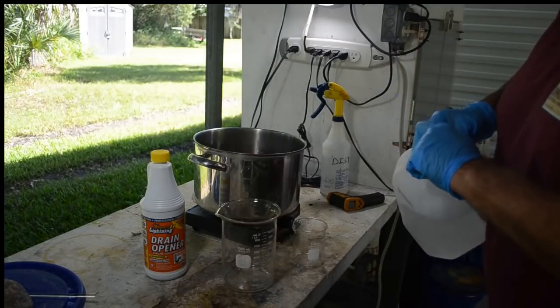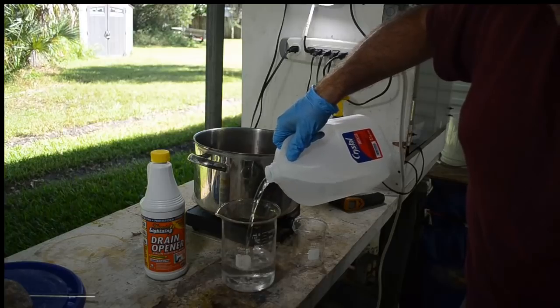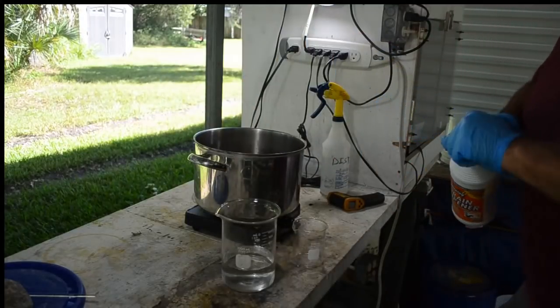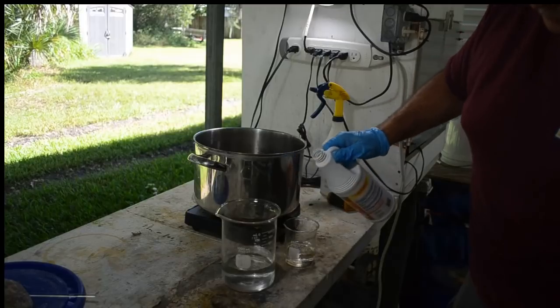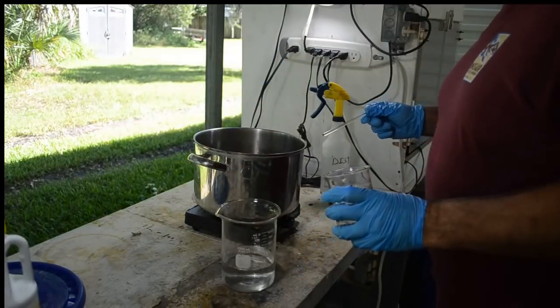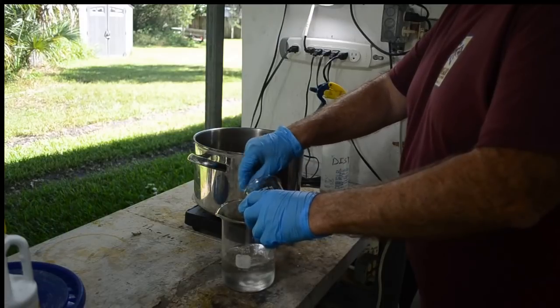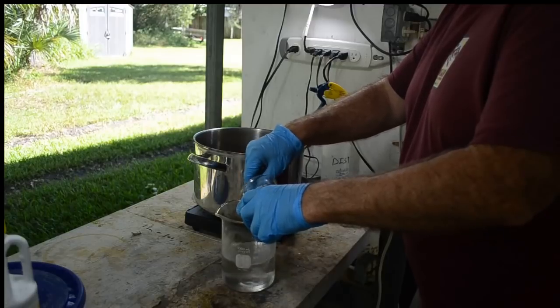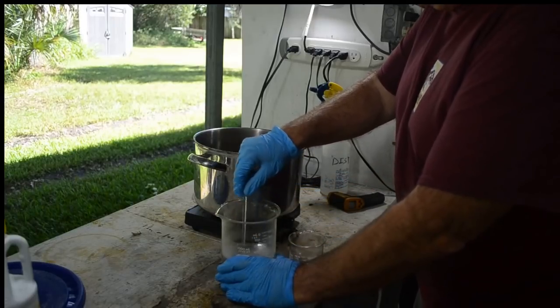So I'm going to put 400 milliliters of distilled water in this beaker, and I'm going to put 100 milliliters of concentrated sulfuric acid in this beaker. I'm going to slowly and carefully mix them, with a lot of stirring. Otherwise, you can have boiling and spattering, which is not good. I'll put about half this acid in. Oh yeah, that got good and hot.